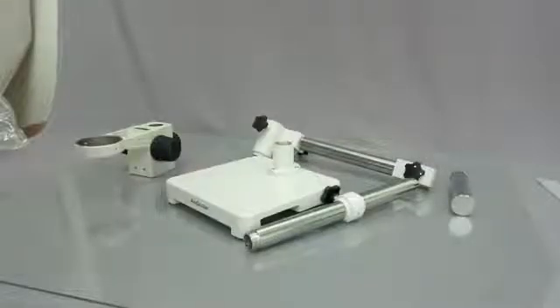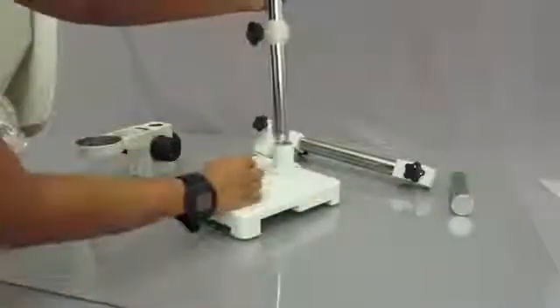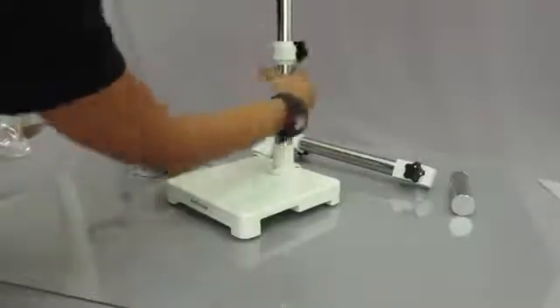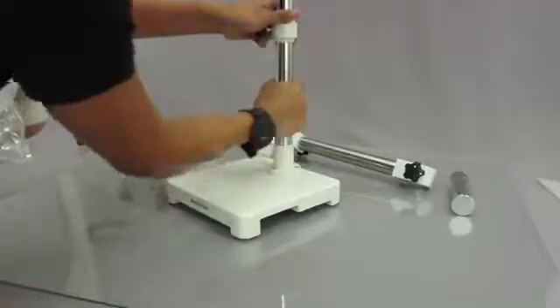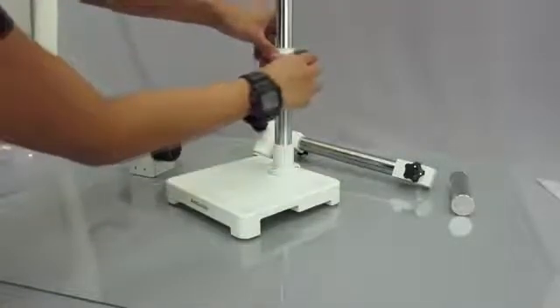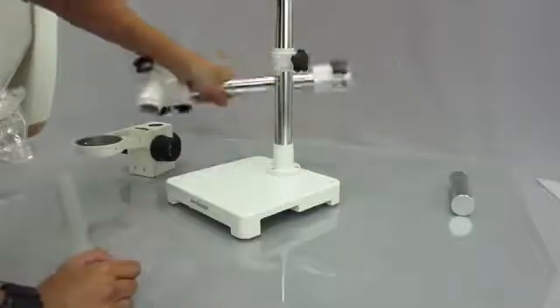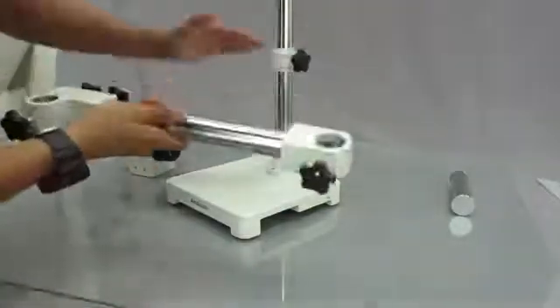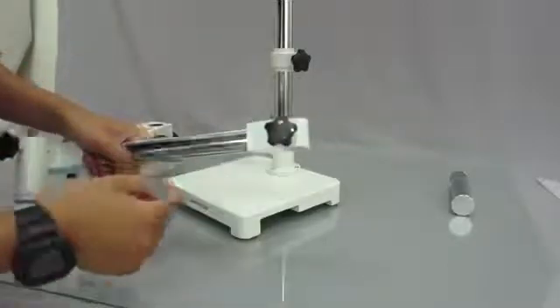Alright, so the first thing you want to do is get the large pole for the stand and place it down here and just screw it in. Now screw it in until it becomes tight. And once you have it in place, tighten this knob. What this part does on the stand is keep the arm that holds the head of the microscope from falling down. So you want to make sure this is as tight as you want. And later on you could readjust it.